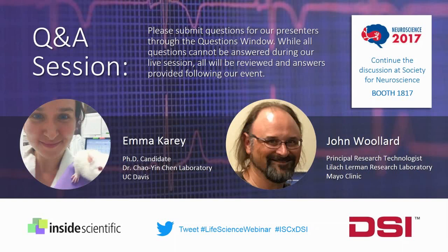But I understand people use blood pressure and it is published because people want to obtain as much useful data from their recordings as possible. So I think physiological purists would say if you can, you should derive them from ECGs, or at least corroborate them with ECGs alongside your blood pressure to know how consistent they are. But absolutely, you can mathematically derive them from blood pressure. Okay. John, any additions there?